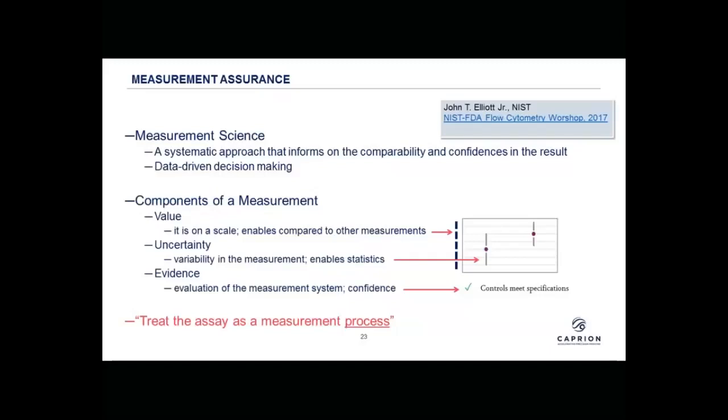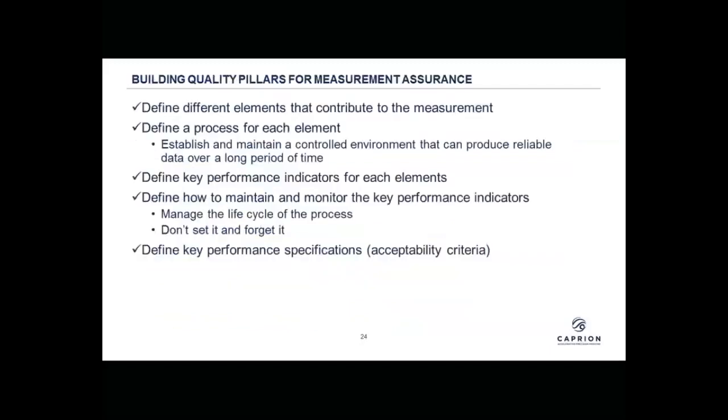And this is what we're going to talk about today: our quality systems give us confidence in our measurement. And then he had a bullet point in his presentation, which I really liked, and he said to treat your assay as the measurement process, and that's what we're going to do today.